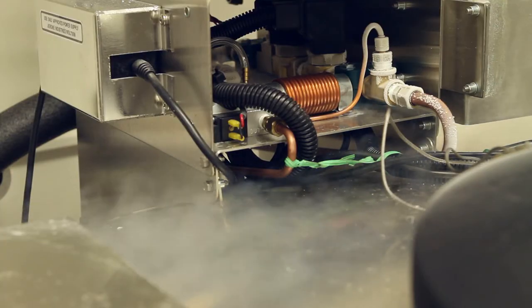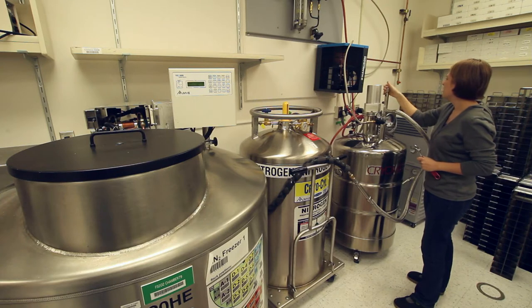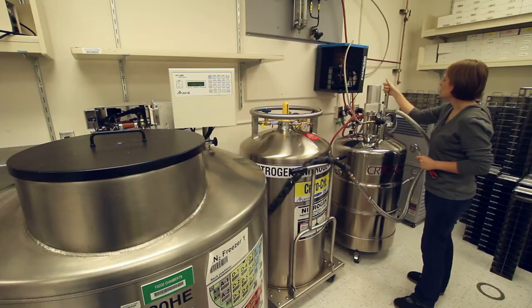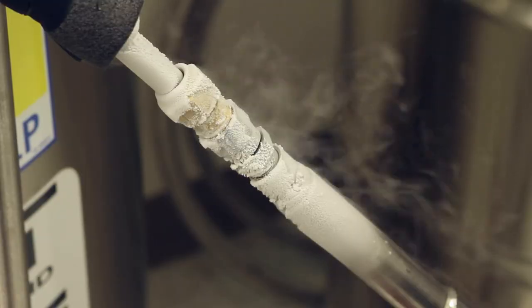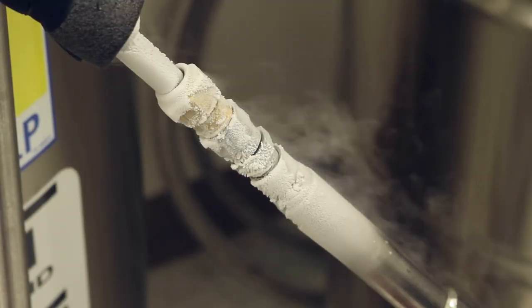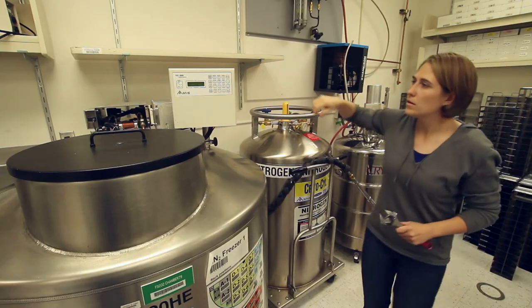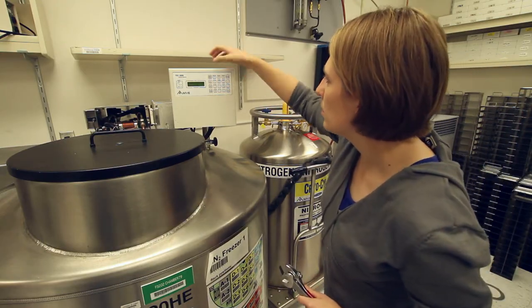Being born and raised in Alaska, I should be used to the cold by now, and working in a freezer room, I prefer still a lot warmer temperatures. With negative 30, anybody needs gloves, even with a minus 80. It's like on the playground, you're not going to go and grab a whole piece of metal or a cold fin without gloves on in Alaska.